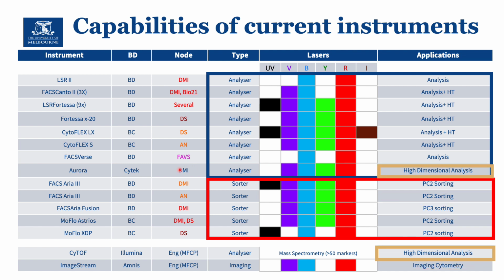We also have in the cytometry platform instruments that can reach at this point 45 different markers with the Aurora spectral analyzers. And of course, you have also the imaging cytometry side of things, which is a combination of cytometry and microscopy, so you can run cells, do raw measurements as you do in cytometry, but also capture images that give you an idea of fluorescence location.